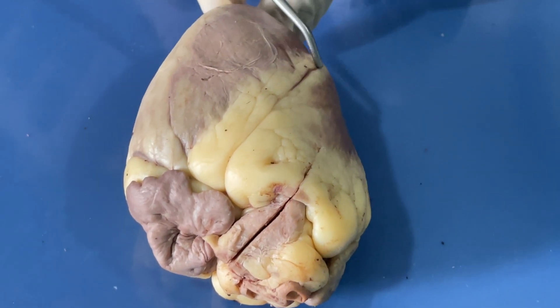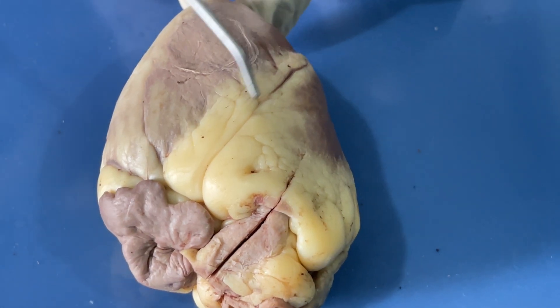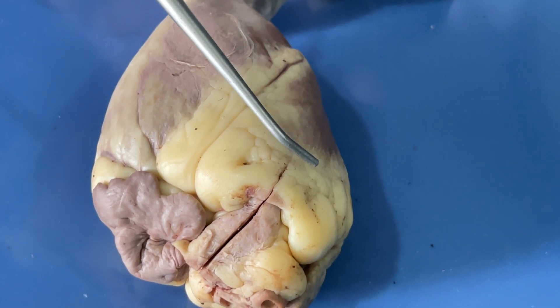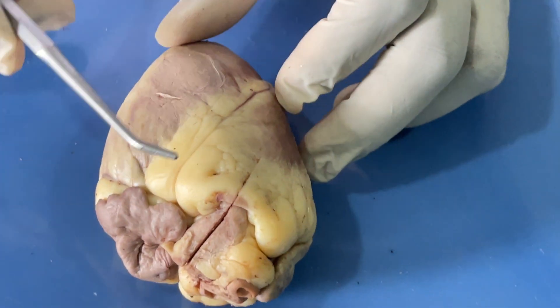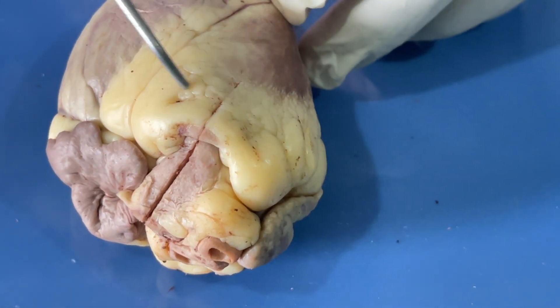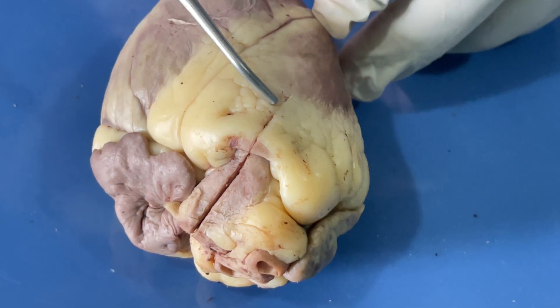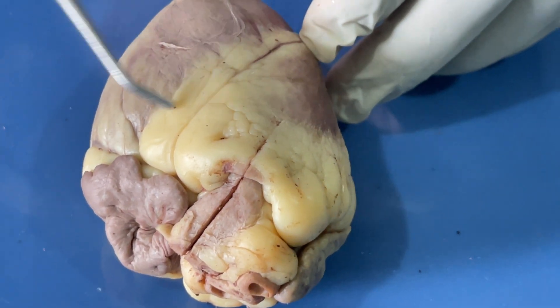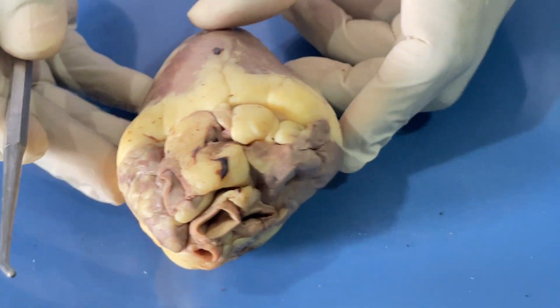We can see this sulcus here — this is the anterior interventricular sulcus and it separates the right ventricle from the left ventricle. We can also observe this white tissue here; the white tissue is the adipose tissue or fat, and it serves as an insulator of the heart and prevents external stretching.